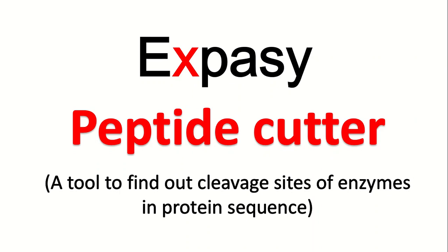Hello guys. This video is about a very important tool called Expasy PeptideCutter. By using this tool, you can find out the cleavage sites or cutting sites of a particular enzyme in your protein sequence. If you have a protein sequence and you want to know at which position a particular enzyme cuts, this tool will show you all the cutting sites of that enzyme.